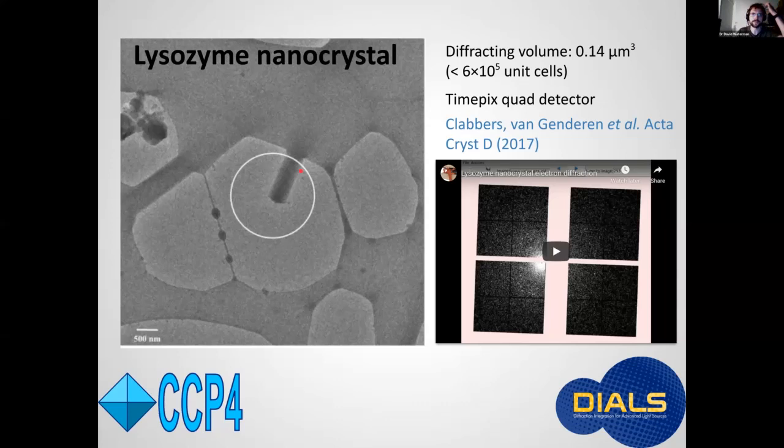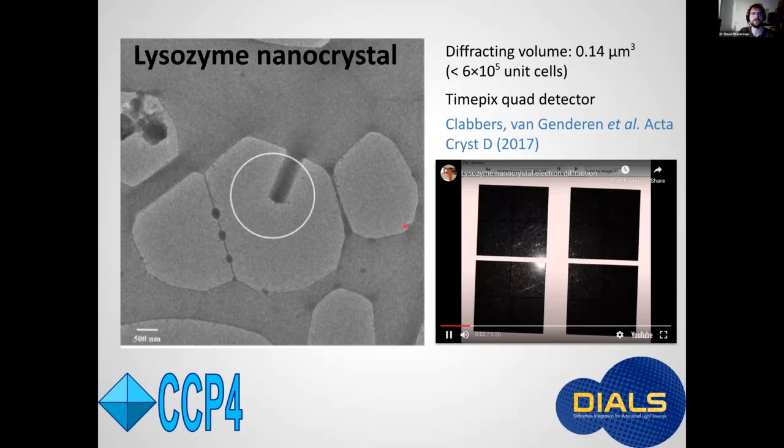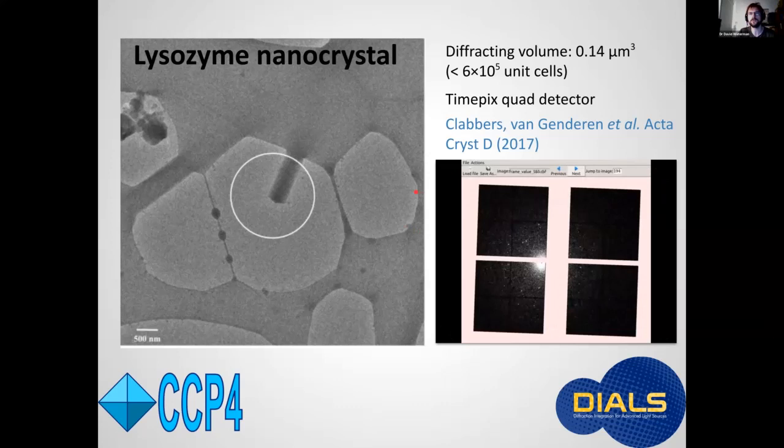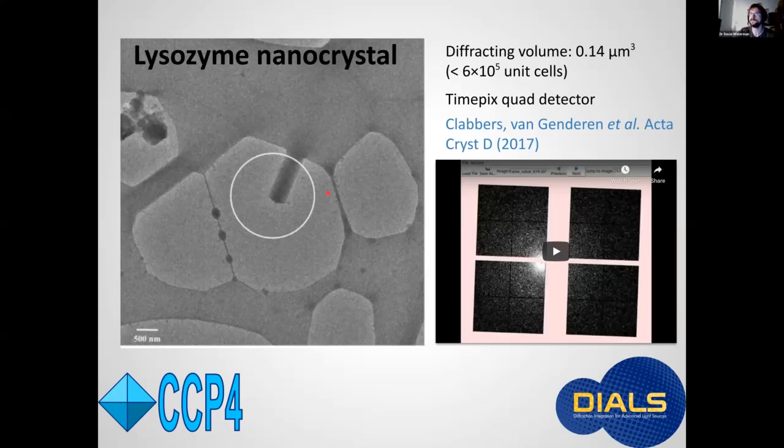We took that data set and others from similar crystals to develop enhancements to dials for electron diffraction processing. Here's a video of the diffraction patterns from that data set shown in the dials image viewer. One thing you can see is that this detector is an unusual quad of timepix modules with large gaps between them. That's not an ideal arrangement, clearly, but timepix does allow fine slice data collection with electron counting free from readout noise.